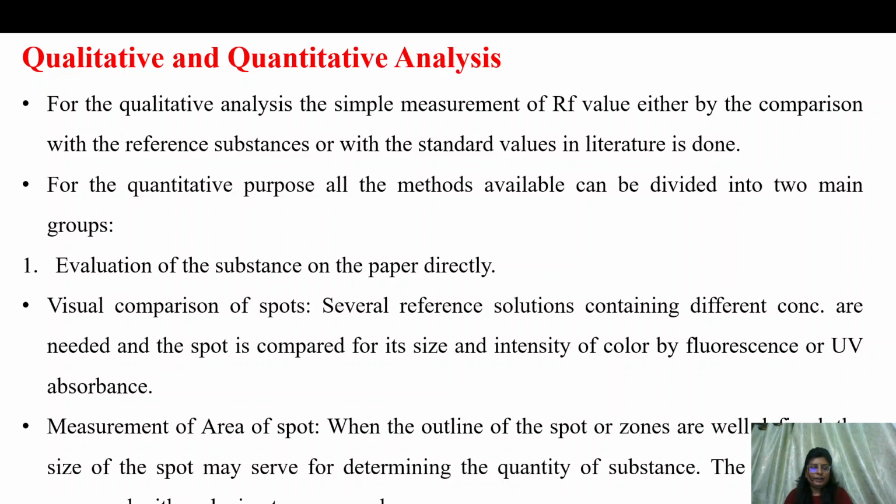Basically, the chromatographic technique is both a qualitative and quantitative technique. For qualitative analysis, a simple measurement of the Rf value is done, either by comparison with a reference substance or with the standard value in the literature. For quantitative purposes, you can use visual comparison of your spot and measurement of the area of the spot.